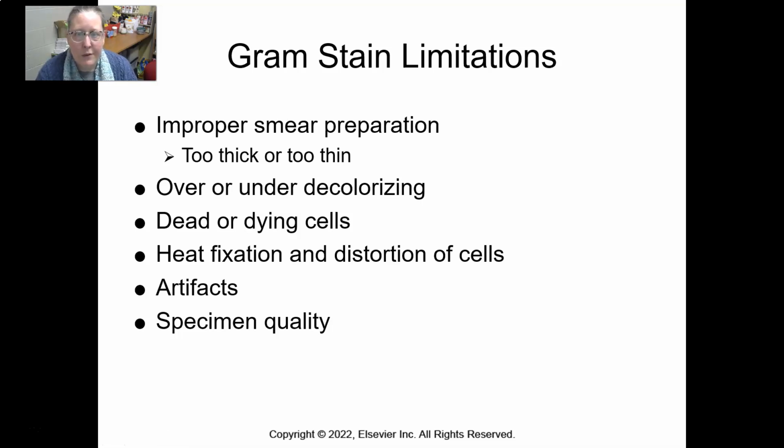So some of the limitations of the Gram stain: if the smear is not prepared properly, so too thick or too thin, sometimes it can be difficult with things like spinal fluids if they don't have a lot in them. Ideally, you want to concentrate everything on there. It's a problem if it's too thick, or if you grab too much of a colony. Sometimes I have students get a little too happy with that and just grab too much bacteria. And then even with the water, there's not enough to thin it out, and then you can't really see the individual bacteria because it's so thick on there.